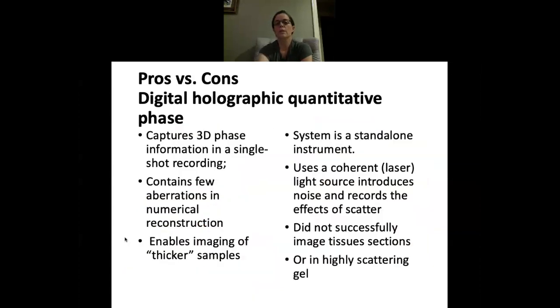In summary, digital holographic microscopy is a very powerful quantitative phase microscopy method and the most advanced in terms of commercial development for use in biology and biomedicine. Despite all of these advantages, the application of quantitative phase microscopy is still not well established due to the complexity and interpretation of analyzing phase images.